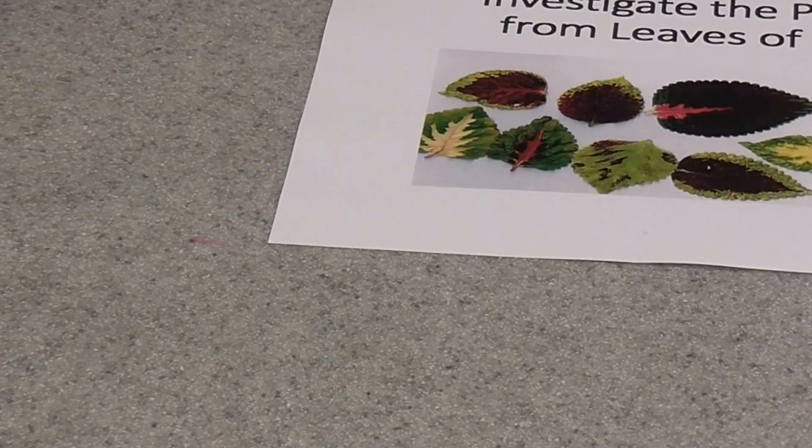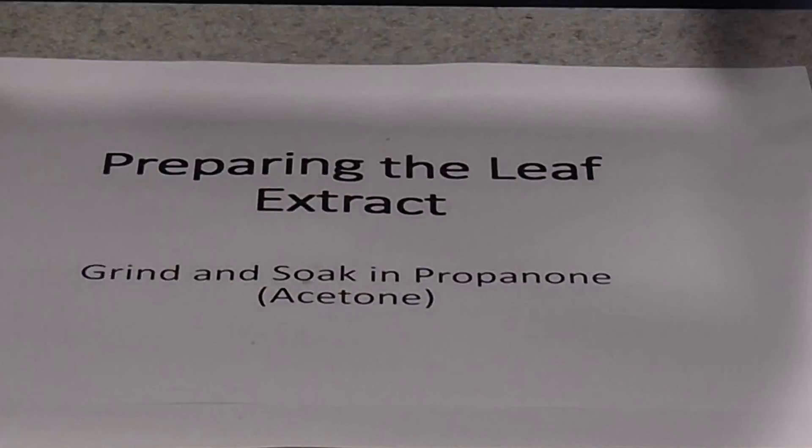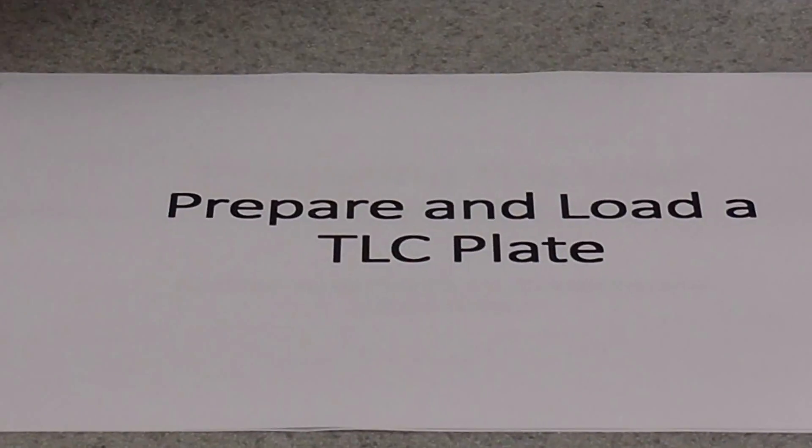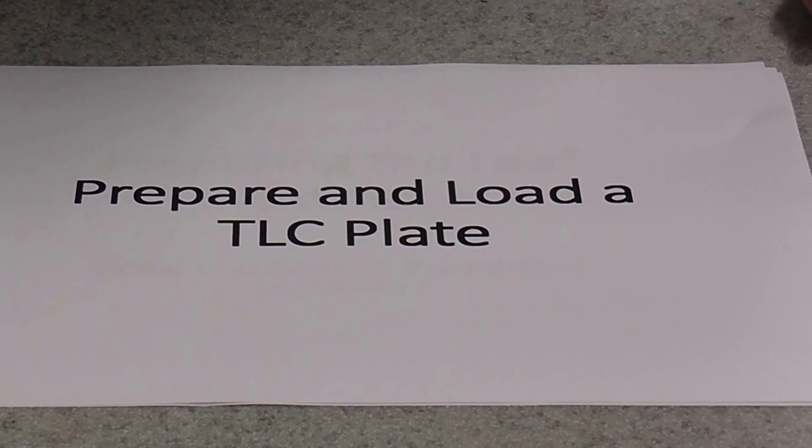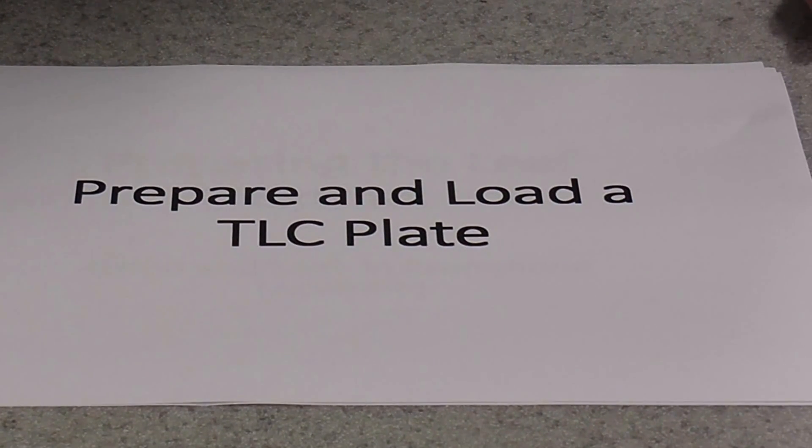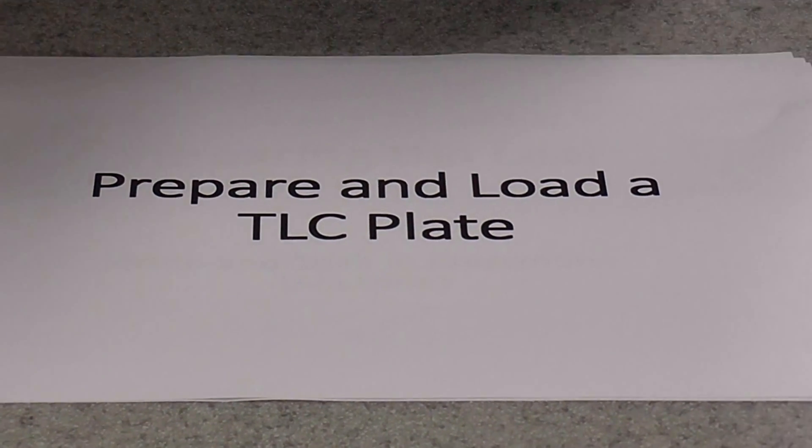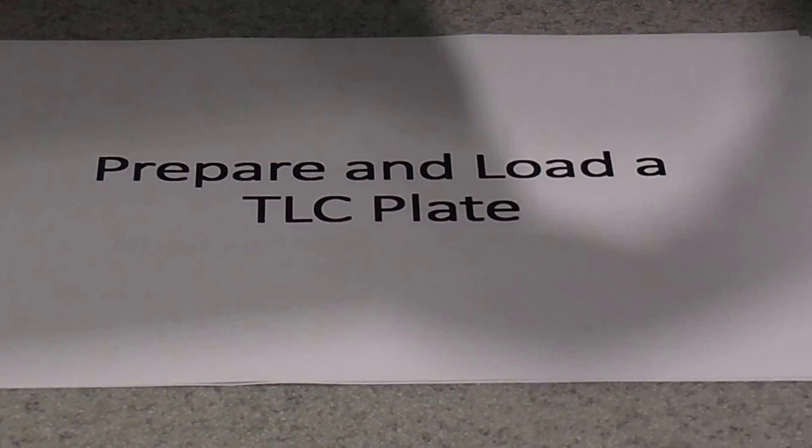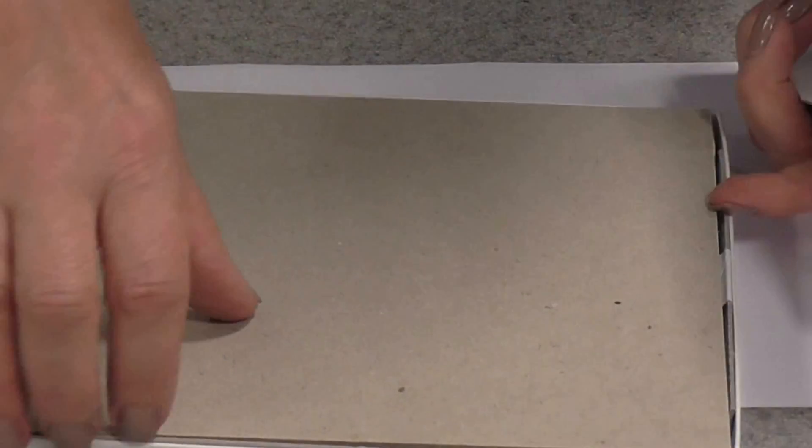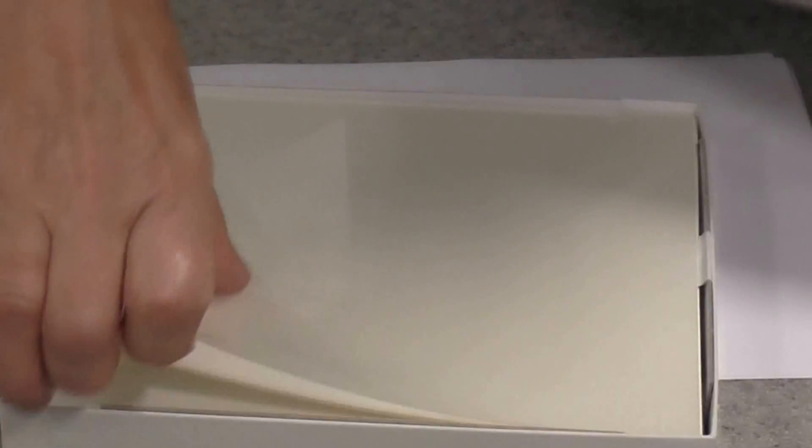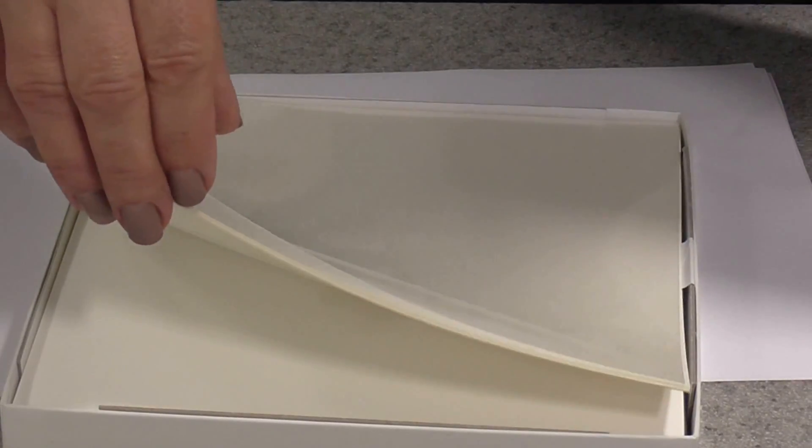Now, the next thing you are going to do is you're going to prepare and load a TLC plate. You can use chromatography paper if you like. It doesn't work quite as well, but it does work. Now, a TLC plate is actually a sheet, you can buy them in boxes, small sheets of plastic coated in a silica gel. And that can be the stationary phase used in chromatography.